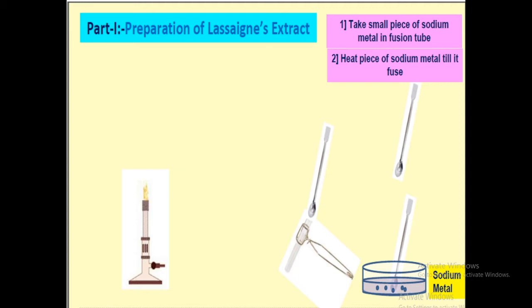First, we have to place a small amount of sodium metal in this sodium fusion tube. It is important to note that sodium is highly corrosive to the skin, so it must be handled carefully and must be stored in organic liquids.